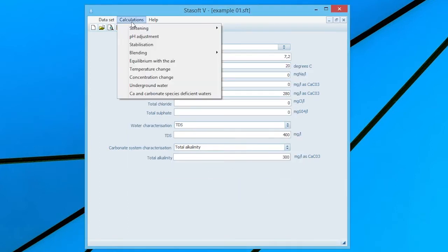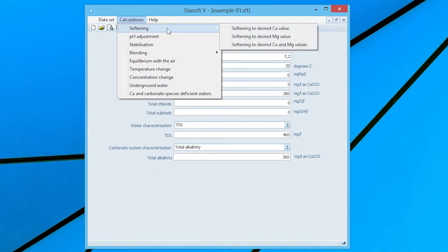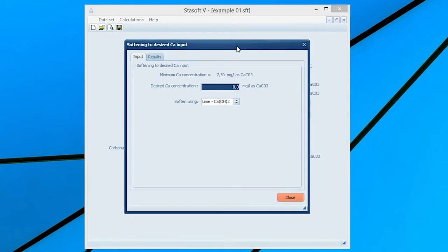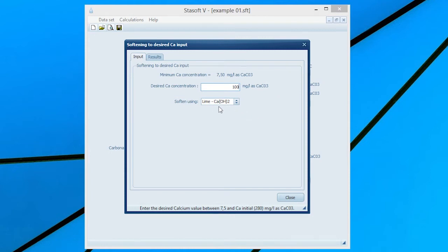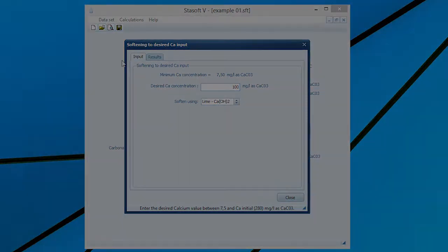Close the window and select Softening and then Softening to desired calcium value from the Calculations menu. Enter the specified final calcium concentration of 100 mg per litre as calcium carbonate by typing 100 in the input box and select the Lime option.